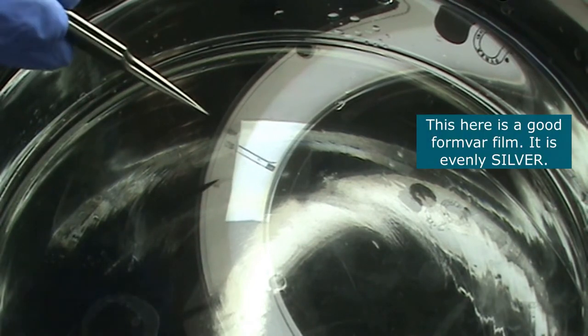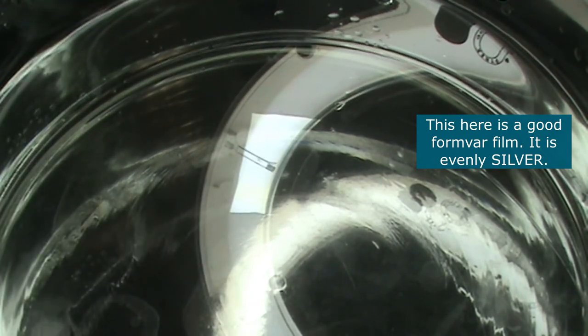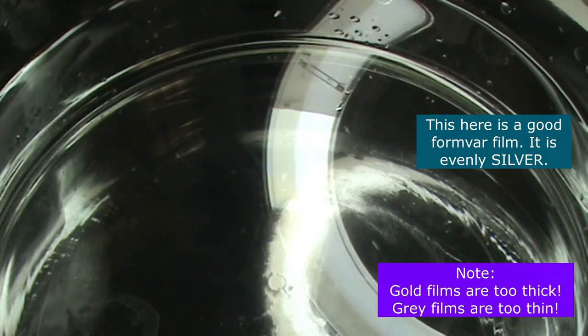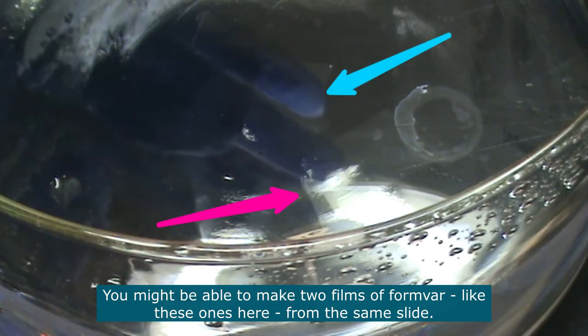This here is a good formvar film. You can see that it's got a nice silver color and the color is quite even on the film, which means that it's a nice film for coating grids. If you're lucky, you'll be able to make two films of formvar from the same slide, like these ones here.